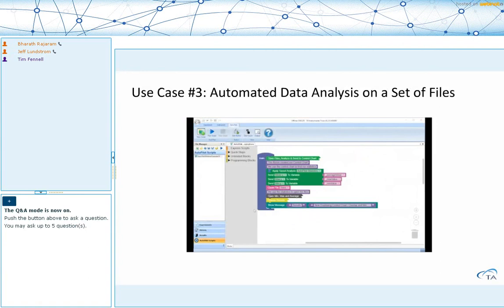The first question that we have, Bharath, is: is there a plan to add this to existing Aries rheometers running on TRIOS? And if yes, by when? Yes, we do have a plan to bring autopilot to other instruments, including our suite of thermal instruments.